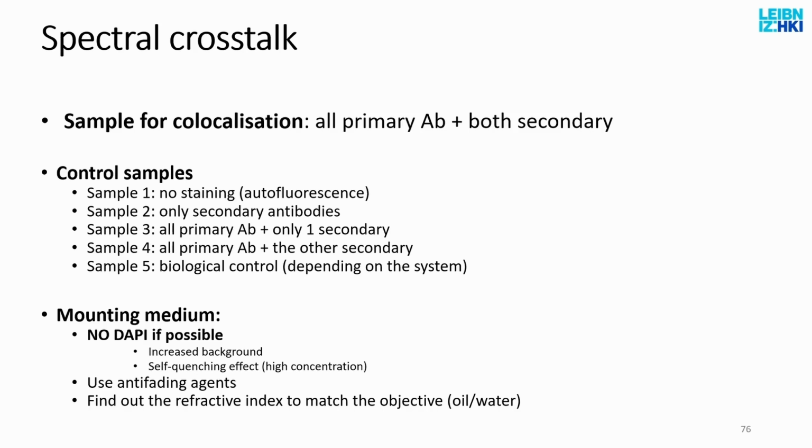The light will come from the objective lens, go through the immersion medium, go to the cover slip or the bottom of the petri dish, go to whatever is the sample medium, usually water, and then get to the tissue, get to the cells. So it travels from glass to water. What do I do here? I put water. Why? Because I travel a lot in water inside the sample.